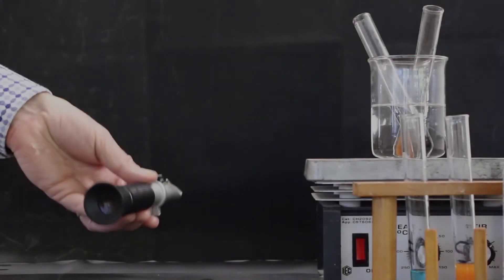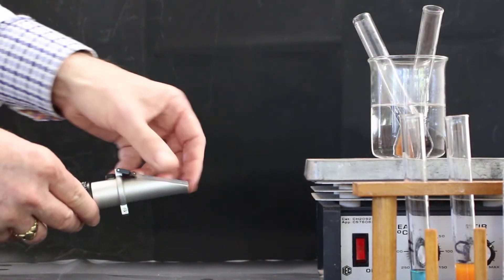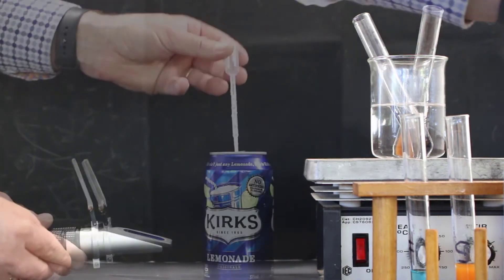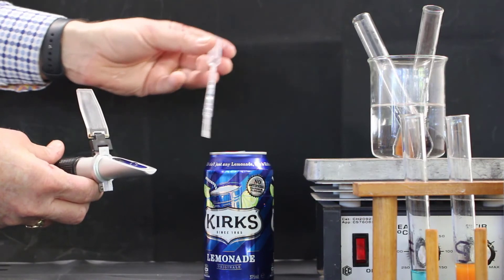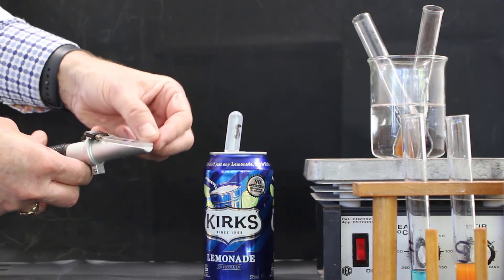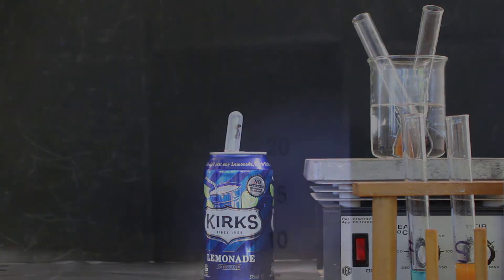However, there is another test we can do as well. This device is a refractometer. We put a few drops of the liquid on the screen and then look through the instrument into the light. You can see there is a line indicating the presence of sugar because the sugar refracts the light.